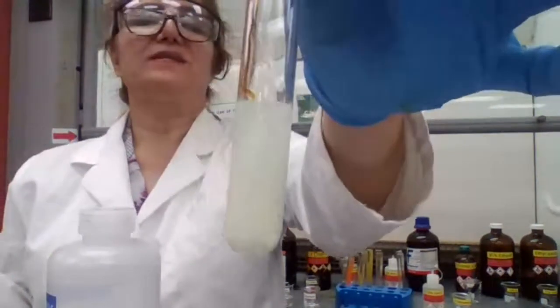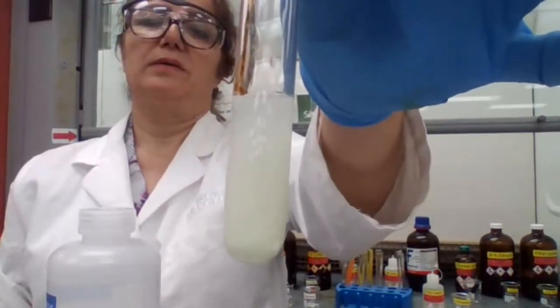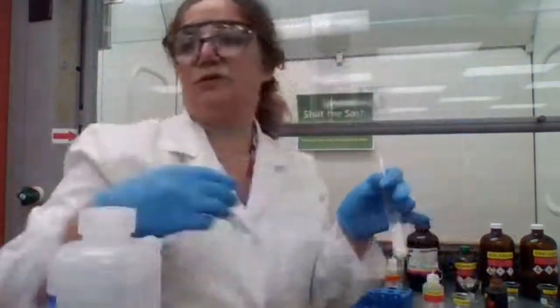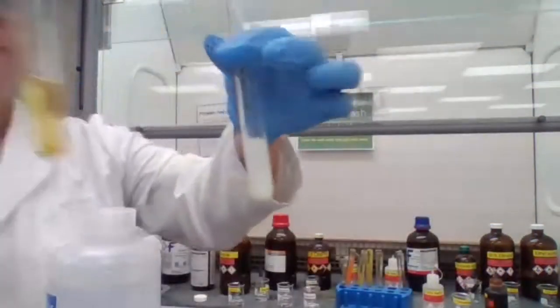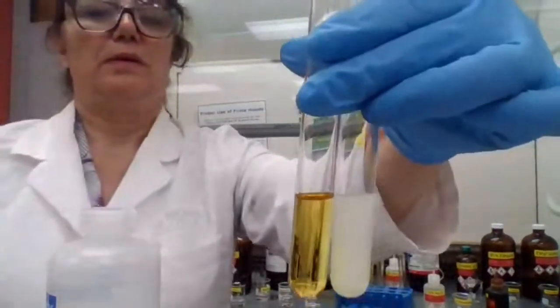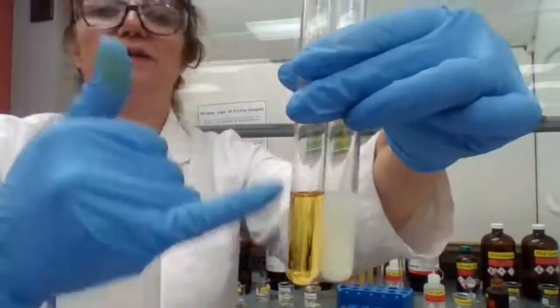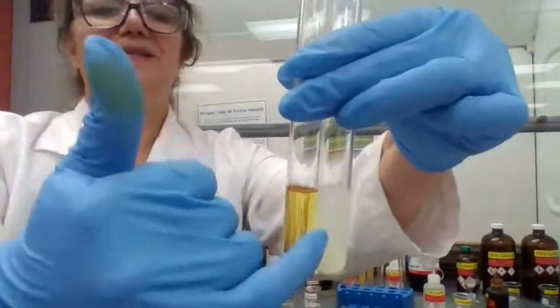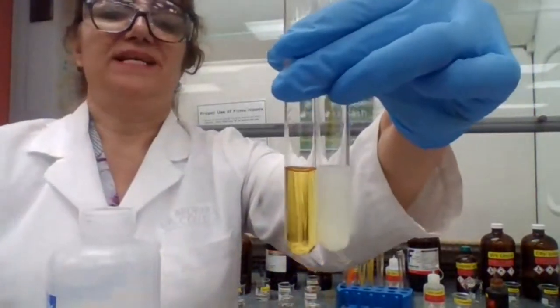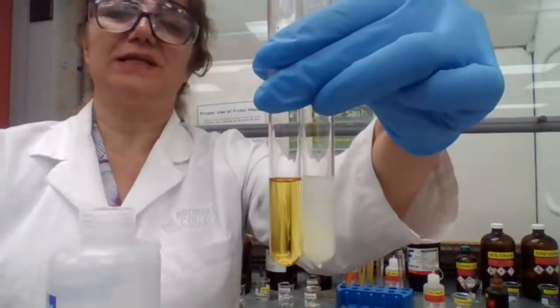A positive test for iodoform. So I want you to take a screenshot of this too. Negative test for iodoform, that's the color that you should have at the end. Positive test for iodoform. This means your compound is a methyl ketone.